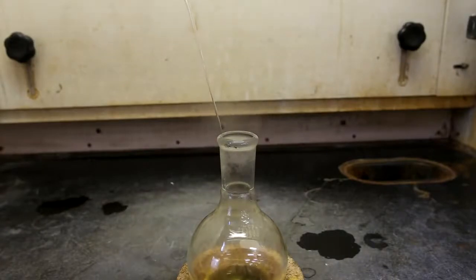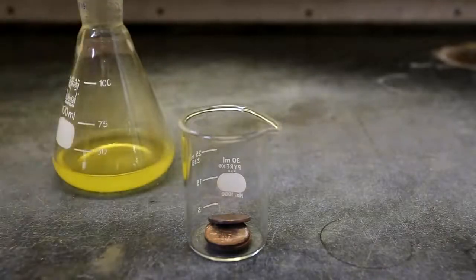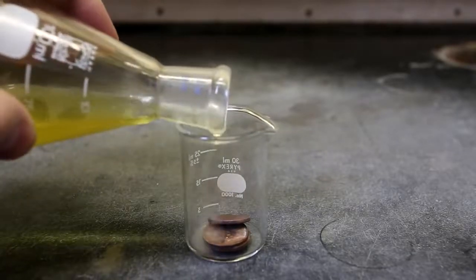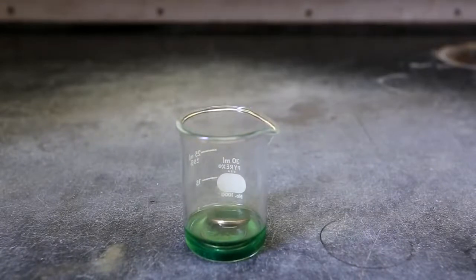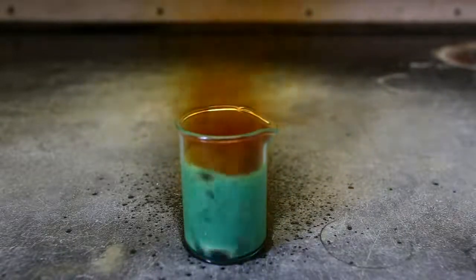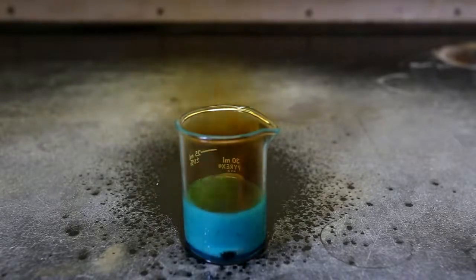It is called fuming nitric acid because at concentrations above 86% nitric acid, it fumes when you expose it to air. To test the nitric acid, I poured it on a couple of copper pennies. Nitric acid is one of the very few acids that will actually dissolve copper. However, when highly concentrated nitric acid is added to the copper, it forms a protective copper oxide layer which prevents further reaction — this is called passivation. When a small amount of water is added to reduce the concentration, the passivating effect disappears and it quickly and vigorously reacts with the copper.